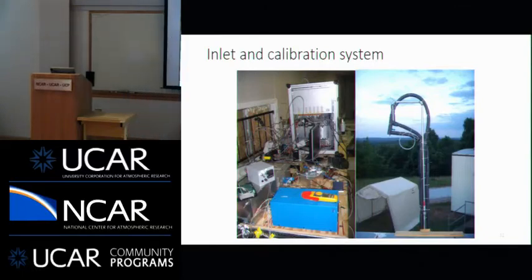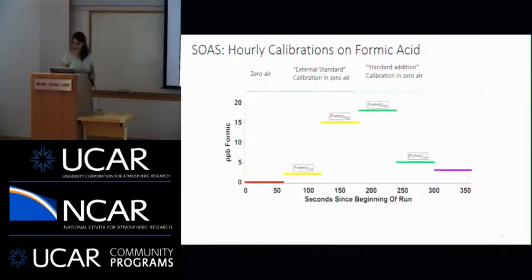And then we had a separate inlet, actually we had two of them, so we could add zero air, so we could do background measurements very frequently, and do calibrations very frequently. And by very frequently, I mean once an hour, which for some gas phase measurements is quite common. I think for mass spectrometry it's a little less common. But we did very frequent calibrations and zeros. We did the calibrations in two ways. So every hour, this is what we would do.